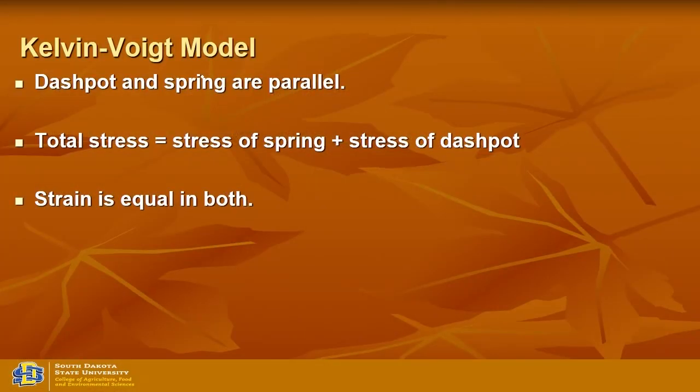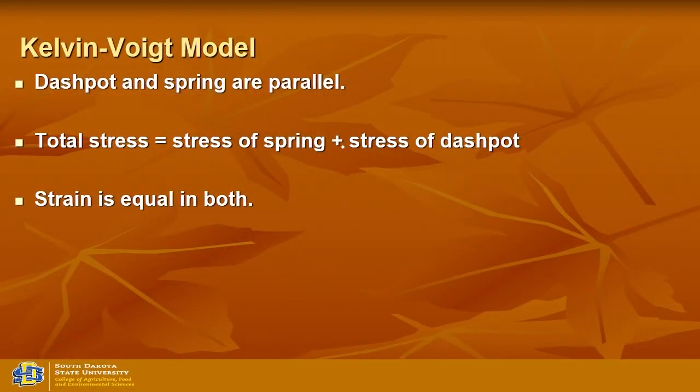That strain output is the output you get, and you can use the modeling for the dynamic test. So here total stress is stress of spring plus stress of dashpot, because we input strain and measure the stress. Previously we talked about inputting deformation, inputting strain and measuring the stress. Same thing here.